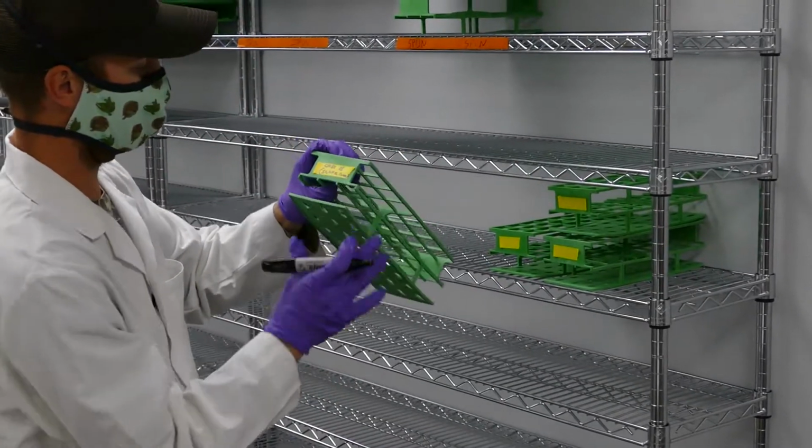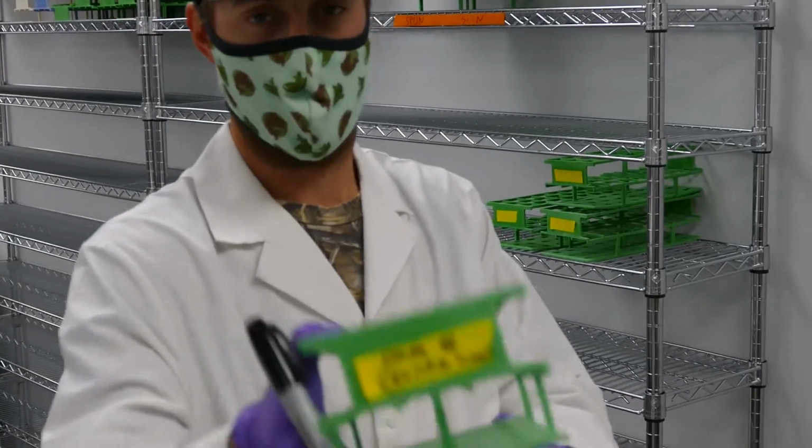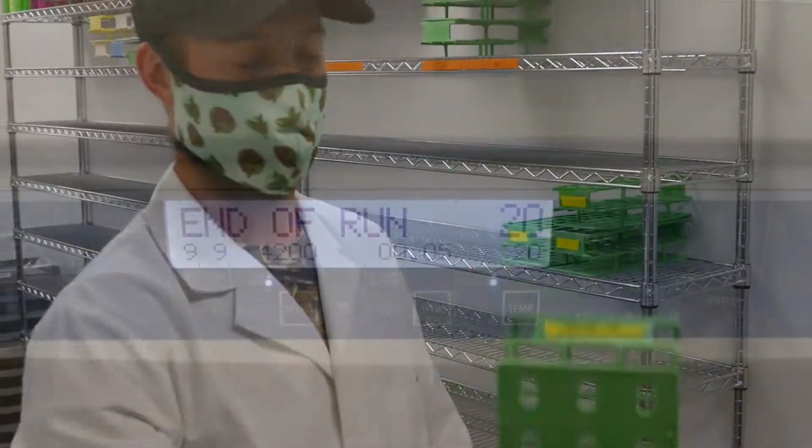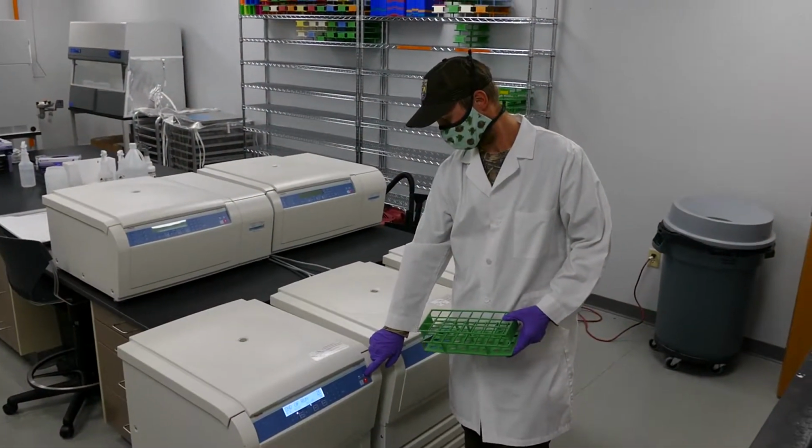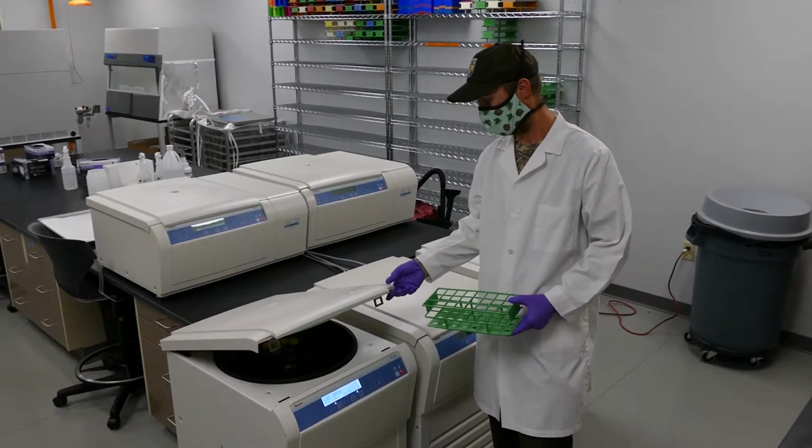Once the centrifuge has completely stopped, place each tube into a clean tube rack labeled with the appropriate case number and sample range. Make sure to keep the samples together and set on the clean workbench.